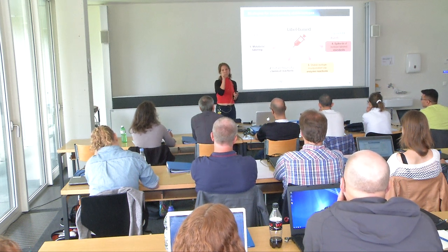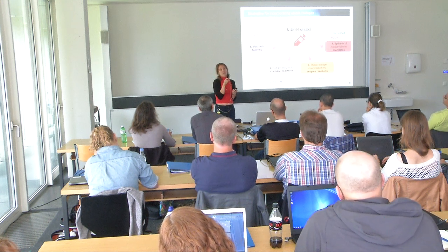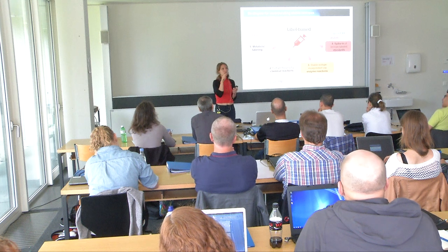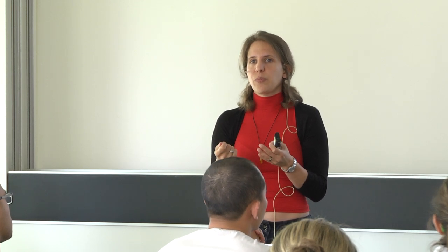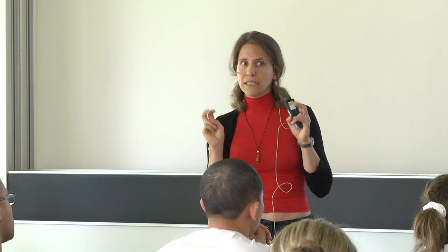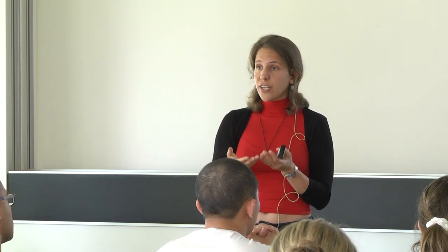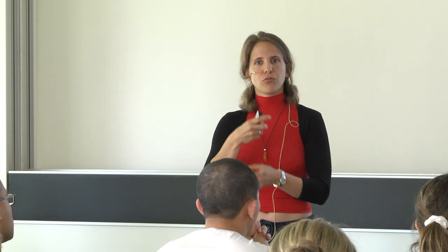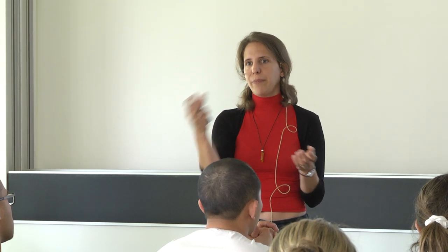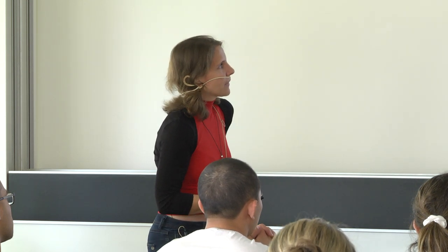Exactly. What you do is you concatenate into a plasmid all the peptides that are of interest for you. And like this, you generate a new artificial protein that is made up only of the peptides that are of interest for you. Then you overexpress this artificial protein in an isotope-labeled media. You purify it, and then you digest this protein together with your sample of interest. And like that, you produce, during the digestion, a lot of peptides that are of interest for you, all in the same concentration. That's the theory of it.